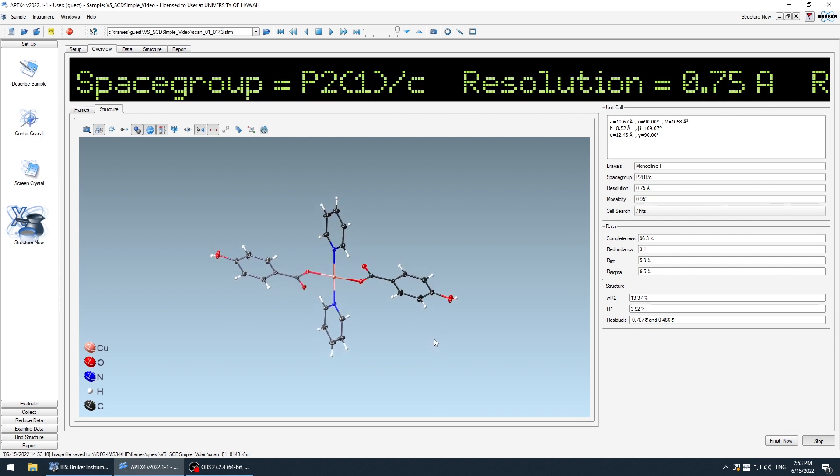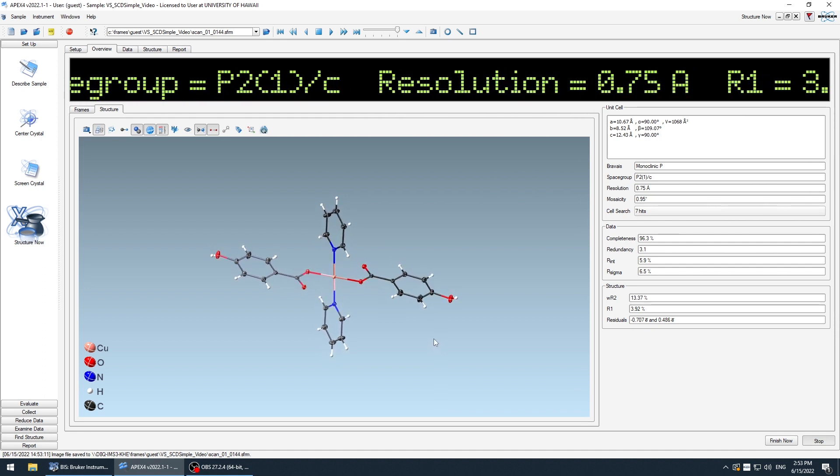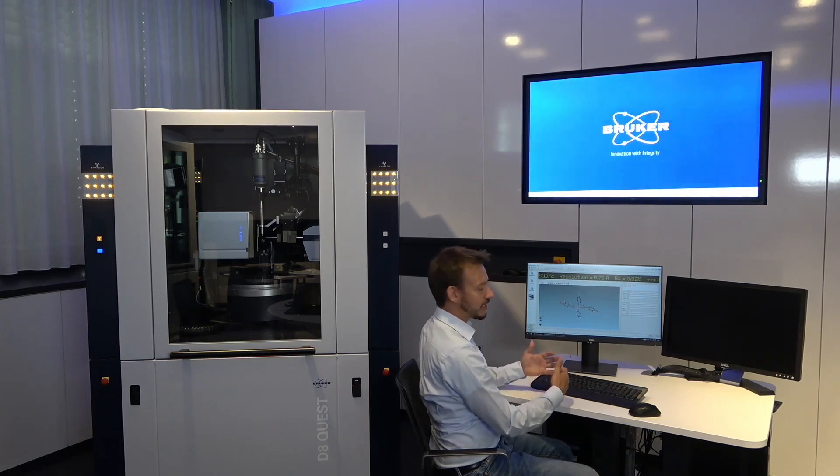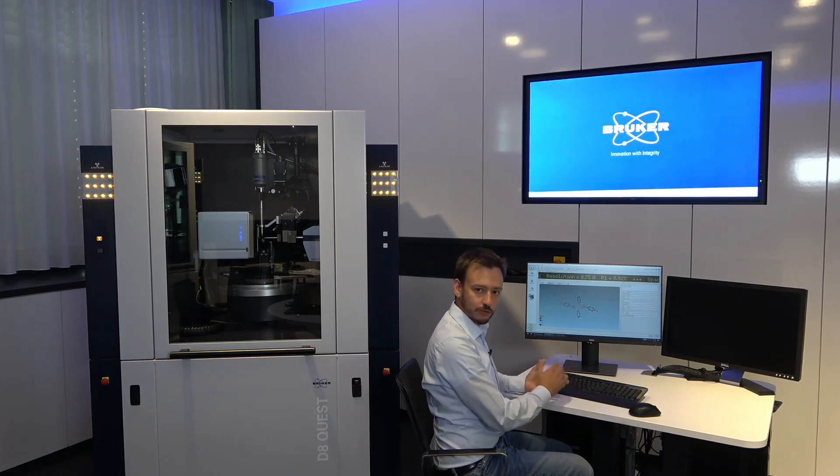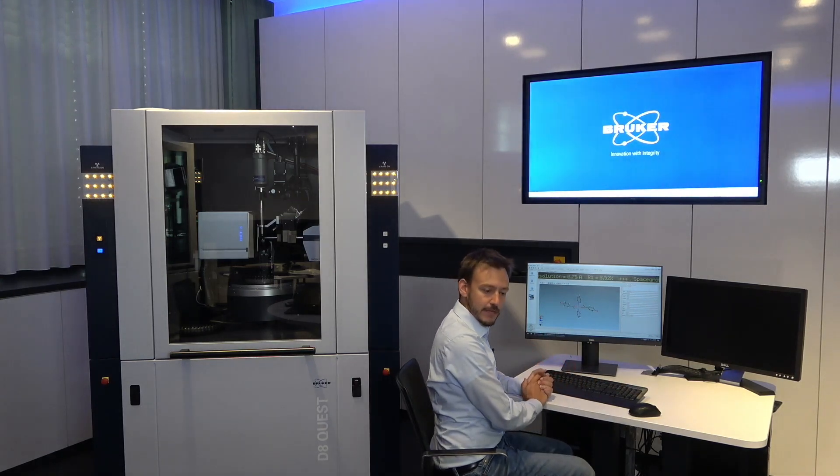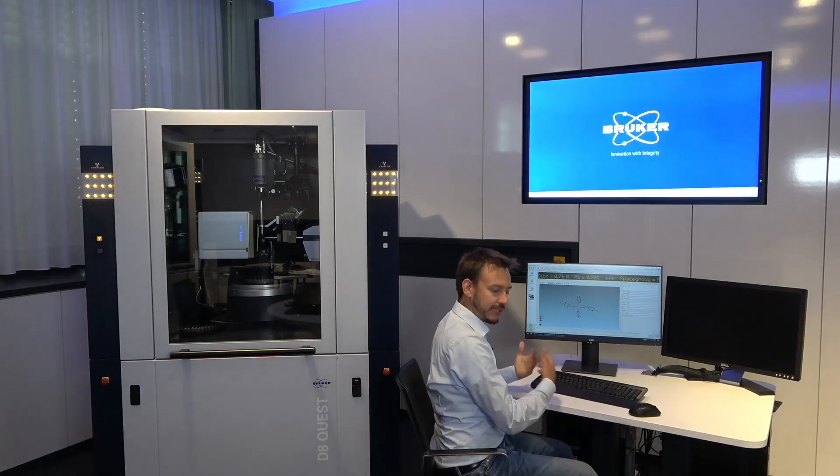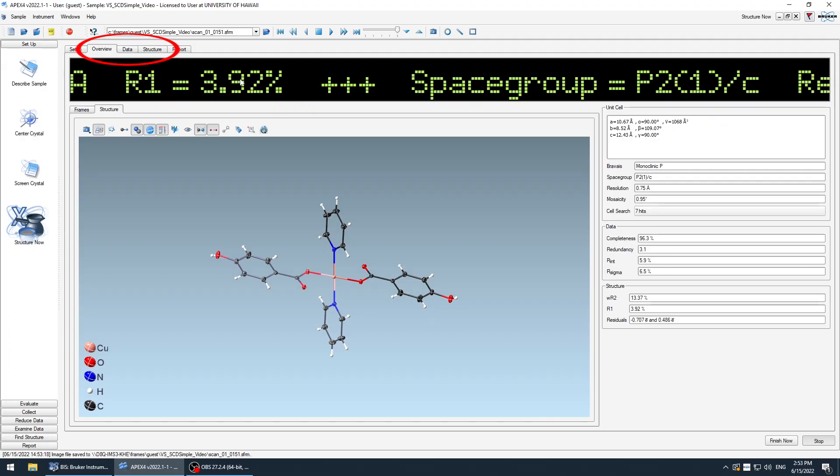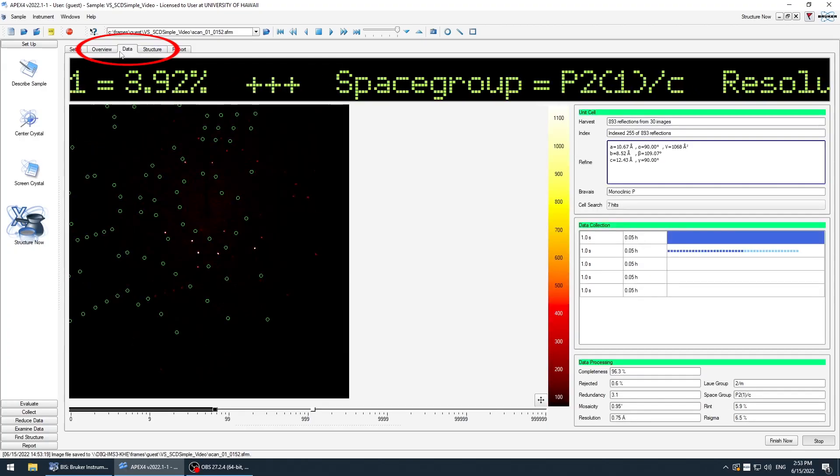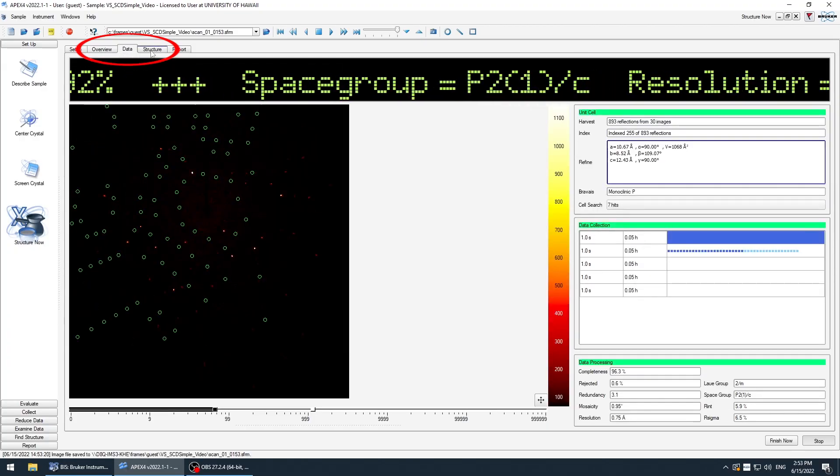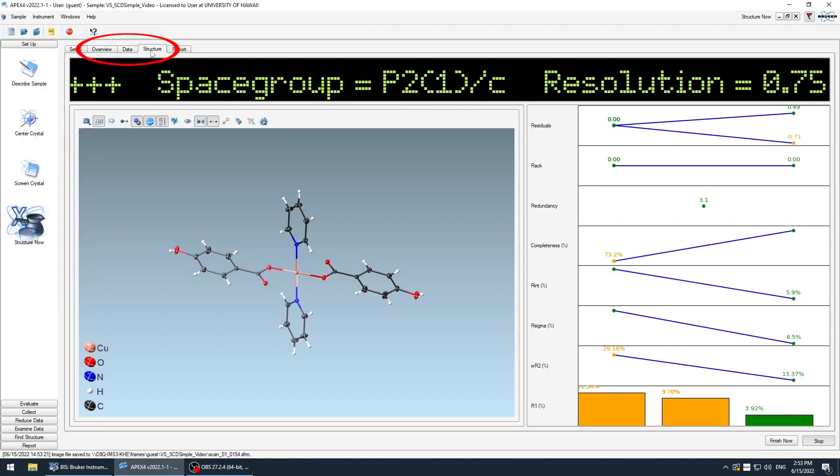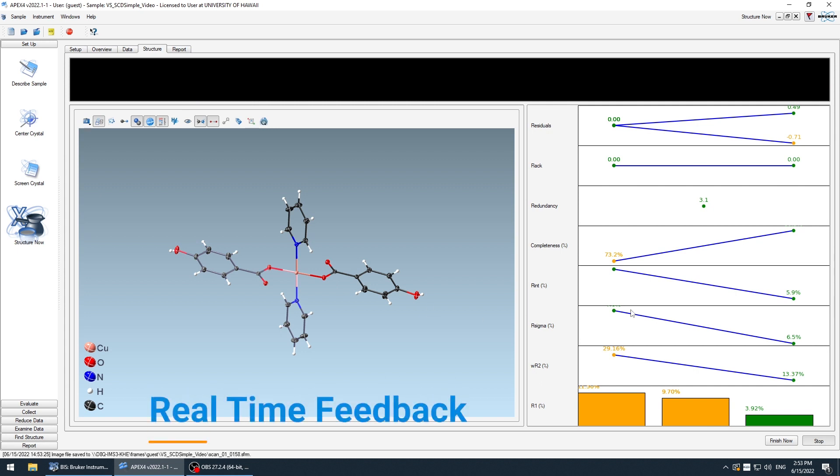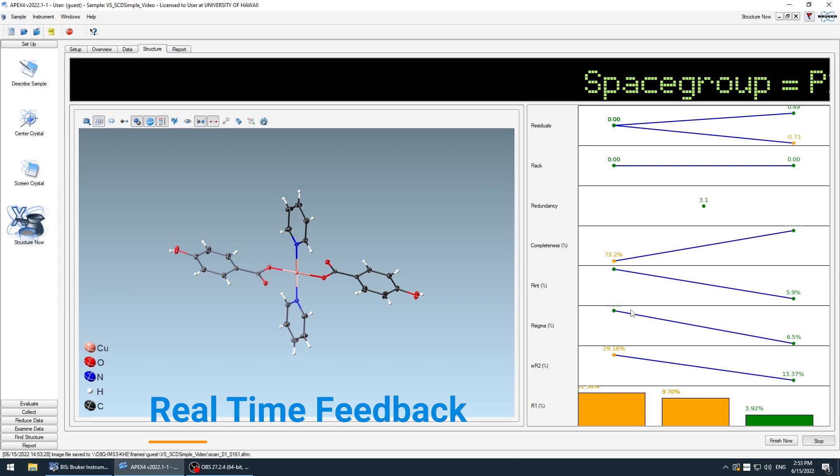So the structure model is completed. The instrument just keeps continuing to collect data to get complete publishable data. And you can follow this here in the structure tab, where it shows you the structure and shows you how quality criteria improve over time.